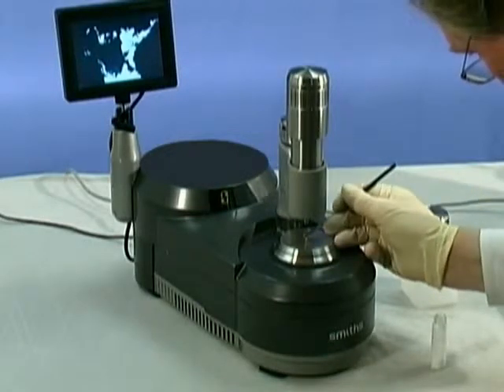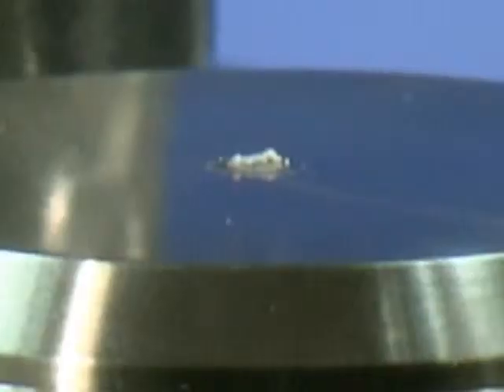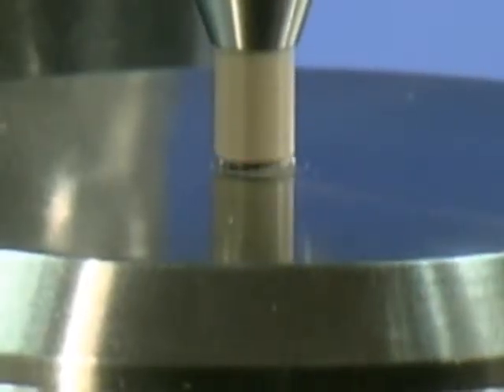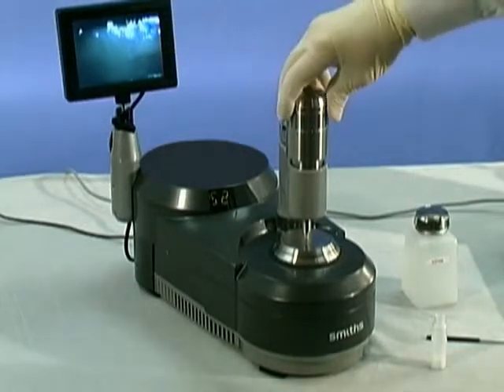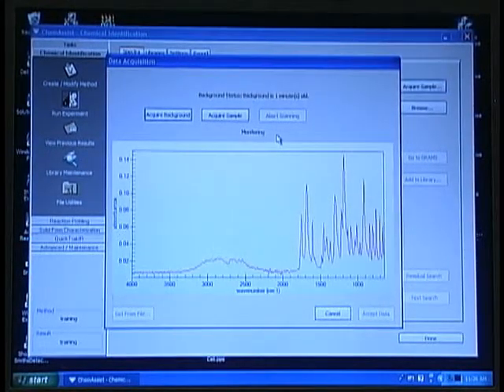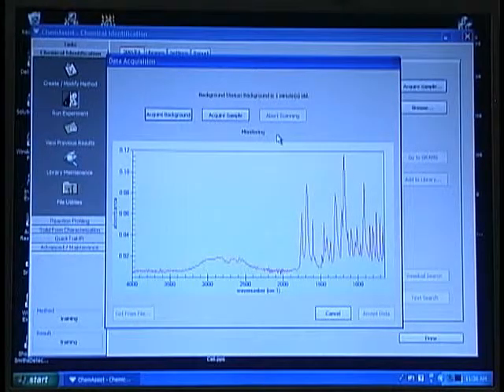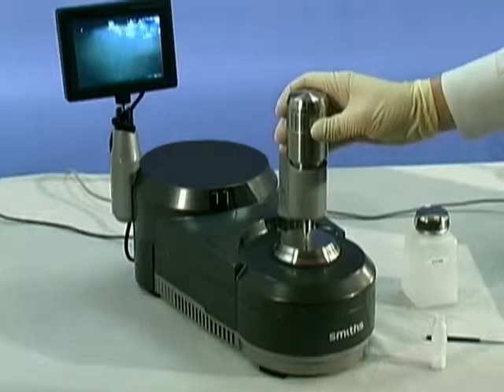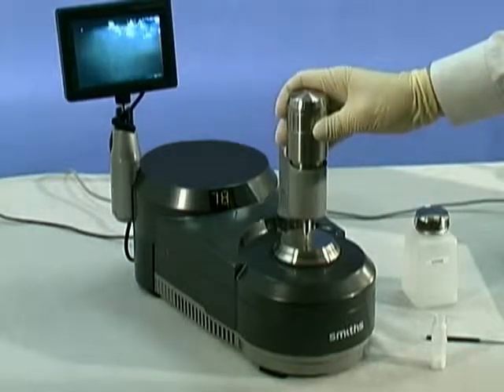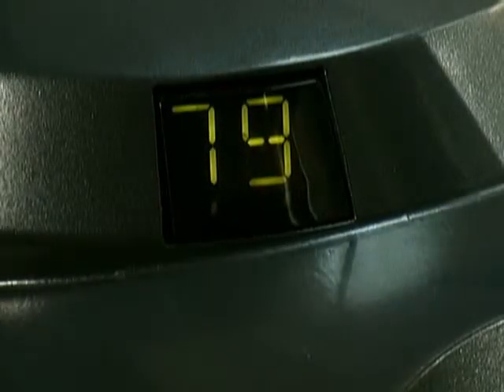Once we have determined that the sample is in place, we lower the sample press until the tip contacts the sample, then we press down on the sample. What we will see in most cases is that the sample spreads out across the surface of the diamond, giving us better contact. We will also see the spectrum for the material appearing in the data acquisition window on the computer. In this case I am taking the sample pressure up to 79, which gives me a good strong spectrum for this material.